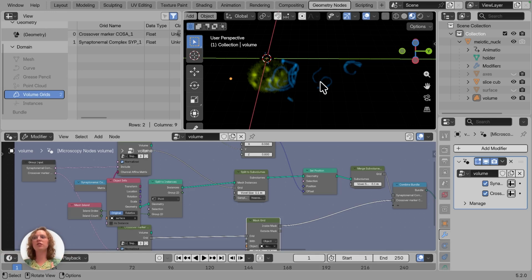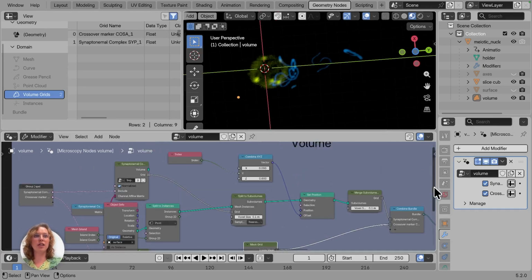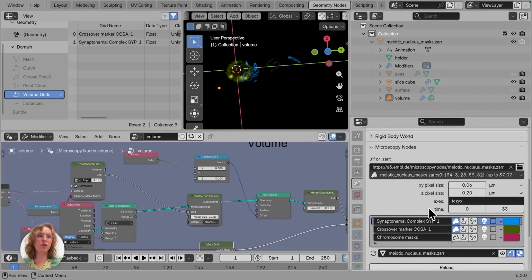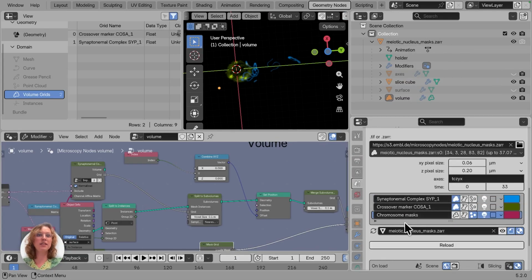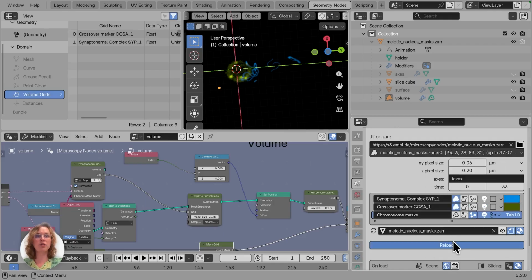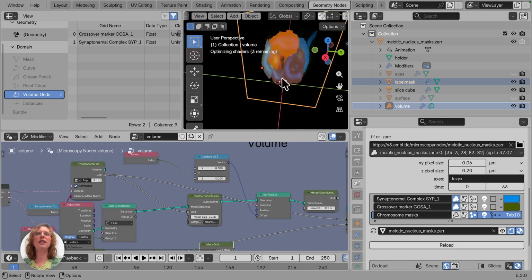And this is a way that we can add extra dynamics and sense of scale to our animations, even if it is not the easiest thing to just set up. It can yield very beautiful things. So right now what we want to get is our actual labels in there. And this dataset includes, so I'll turn off the surface and add the masks of the chromosomes as a label mask with a categorical color map just for easier viewing, where we see these here.